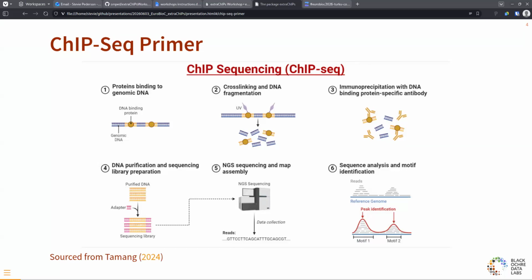So we'll define the peak center and then spread out from that peak center. If you've used CUT&RUN and got a really nice tight peak, then maybe you want to bring in your range. But in reality, the peaks are going to be nicer, but when we compare across samples, I don't think it's going to make too much difference.